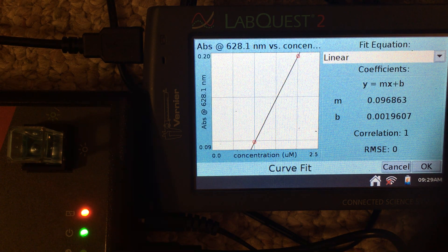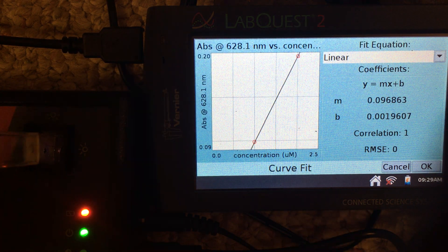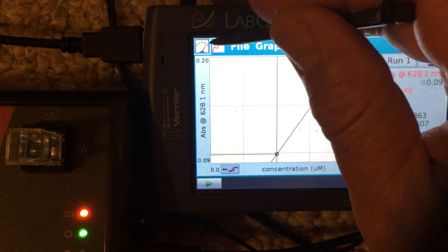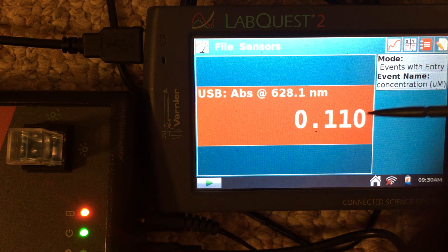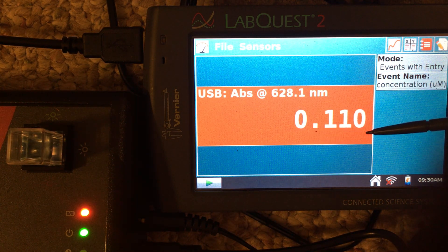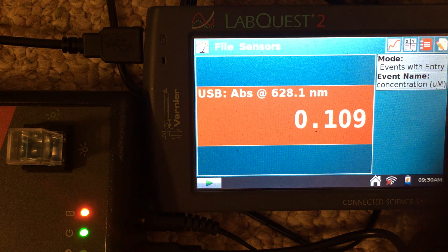Now we can determine the absorbance value of each unknown solution. We place an unknown solution into the spectrometer, hit OK, and go back to the meter tab. We can see the absorbance value for this unknown. We take this absorbance value and plug it into the equation for the best fit line to figure out the concentration of the solution in the cuvette — and that is how we find the concentration of our unknown sample.